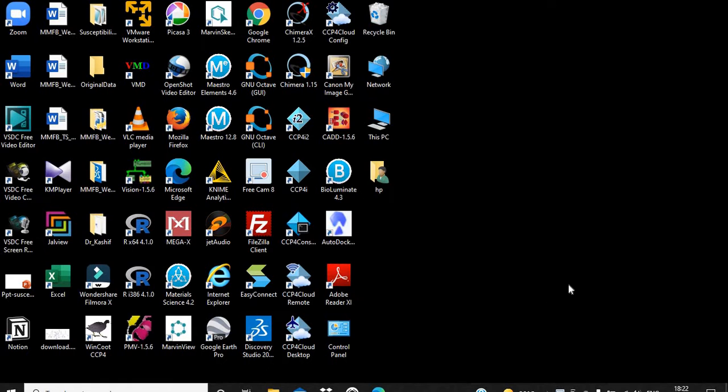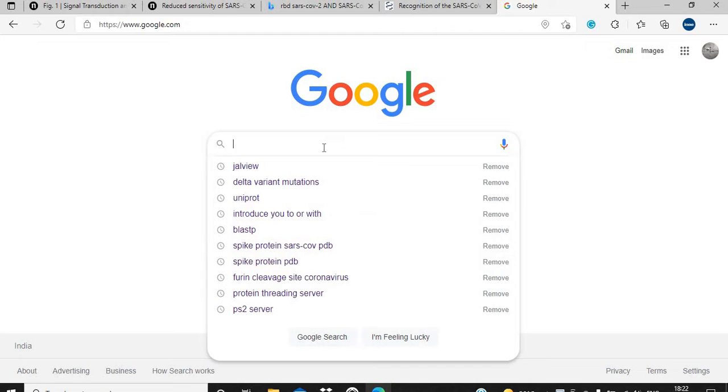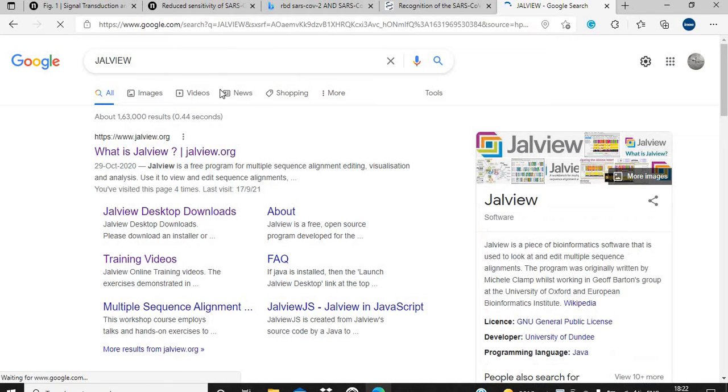So let's start. In order to download Jalview, we first have to visit the Jalview website. You have to type Jalview in the Google search bar, and this is the result. This is the top result.